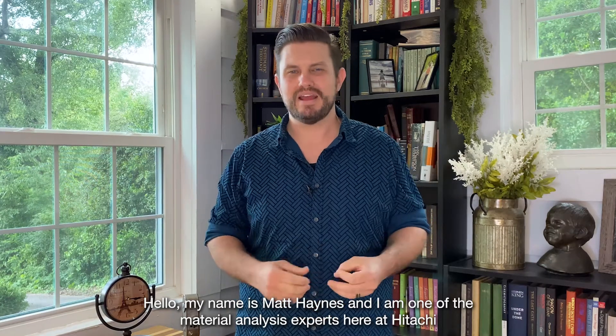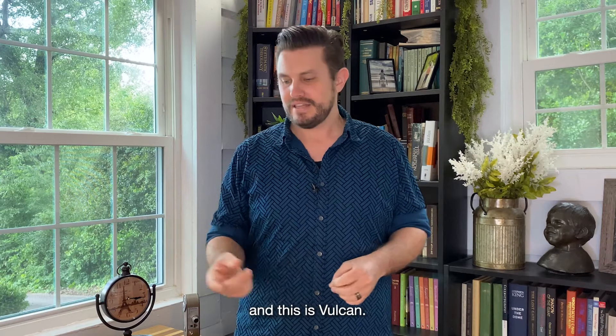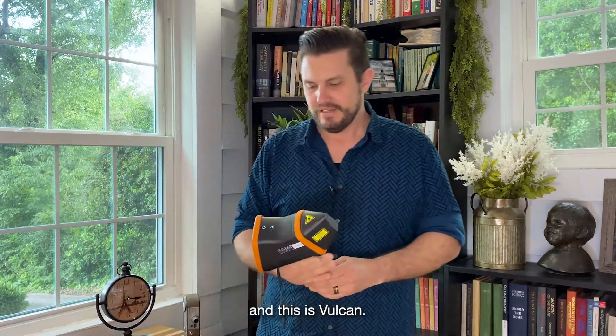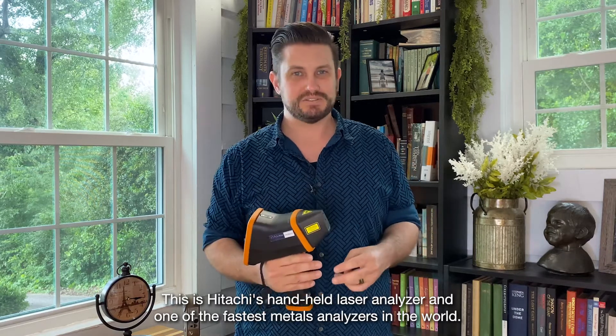Hello, my name is Matt Haynes, and I am one of the material analysis experts here at Hitachi, and this is Vulcan. This is Hitachi's handheld laser analyzer and one of the fastest metals analyzers in the world.